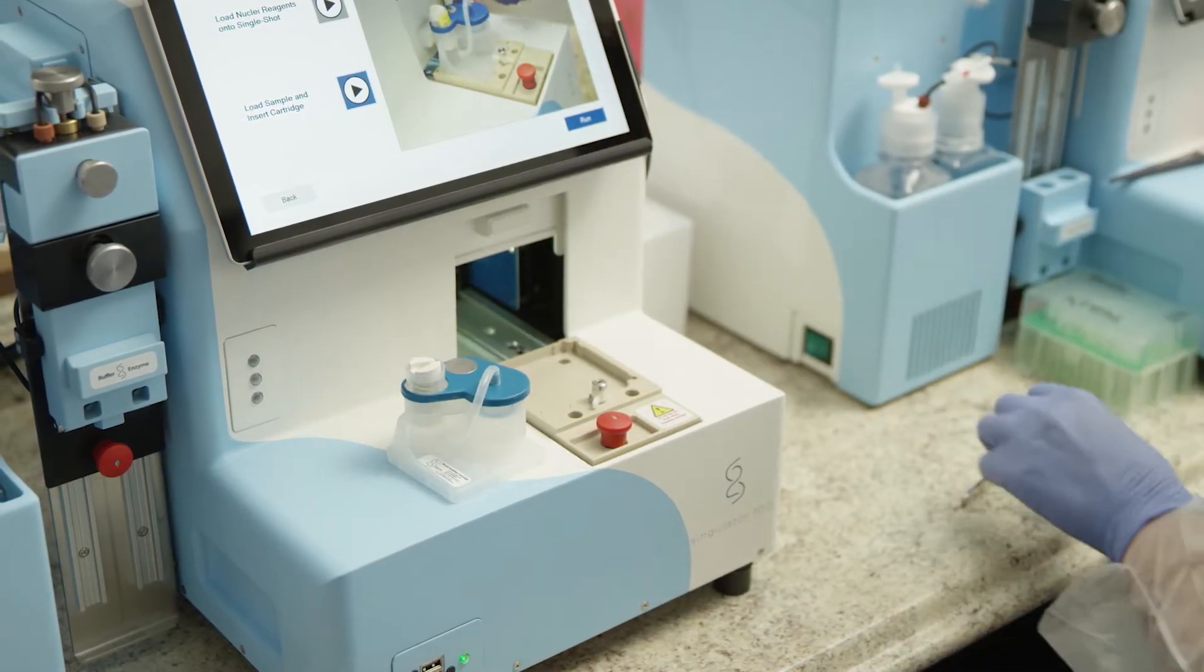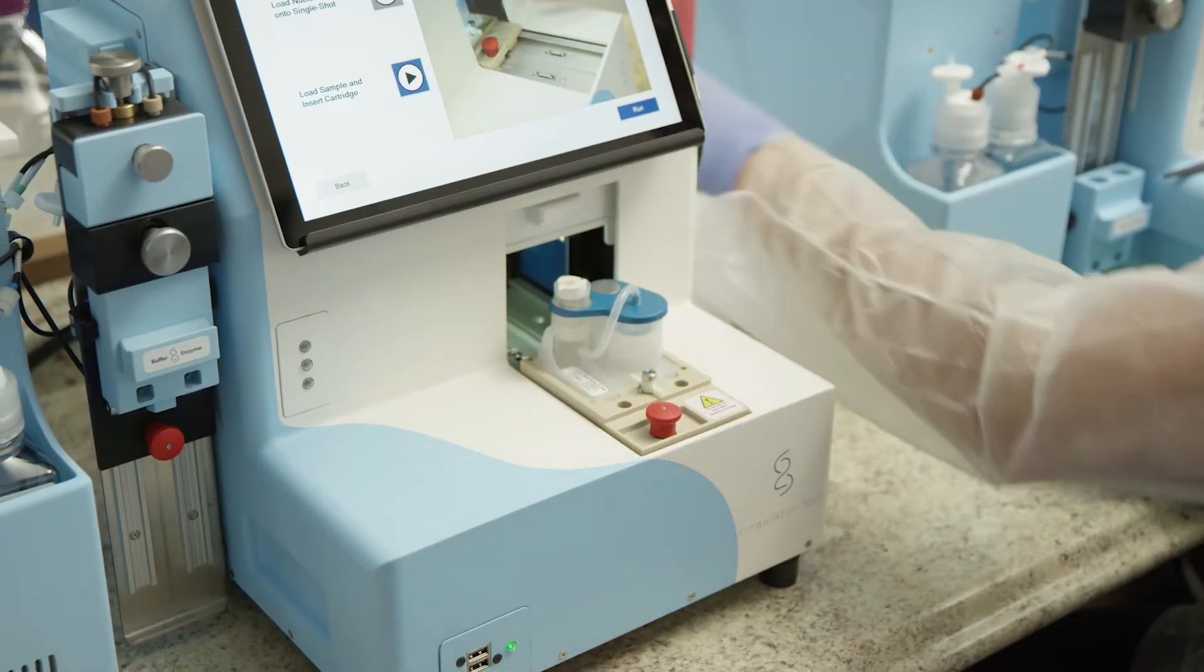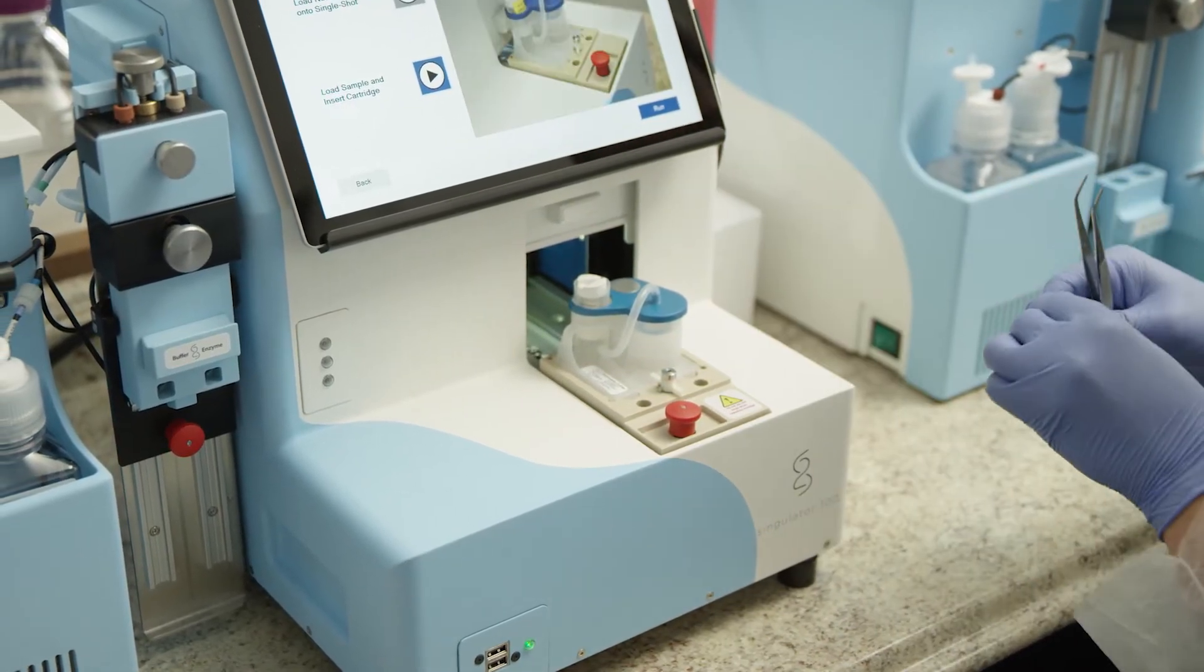Place a pre-cooled sample cartridge on the sample stage in the proper orientation so it sits flat on the stage. Rotate the cartridge lock to secure the cartridge in place.